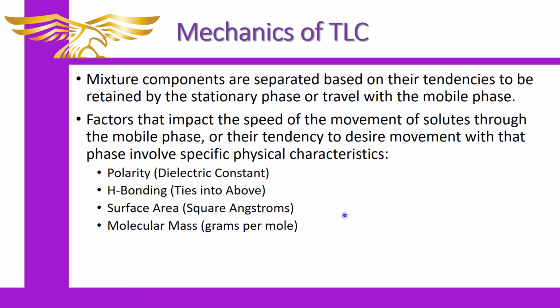Or as they say, carbon tetrachloride. Everybody used to call it tet chloride as a nickname, but carbon tetrachloride is what I'm talking about. So that would be vastly different. Yes, the surface area might be just slightly greater because of the angstroms difference we're talking about with the different atoms involved, but it's also fairly compact.